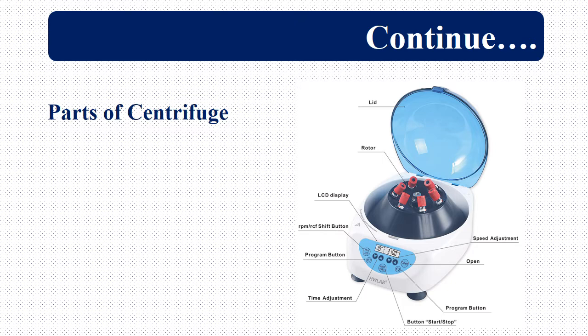Parts of Centrifuge: Centrifuge has lid and rotors which are continuously in the moving stage and then we have LCD display, on which you can set the speed, RPM, and timing of the rotation of the rotors of the centrifuge. On the LCD display, we have RPM Shift-button, we have programming button, we have time adjustment button, and we have the start stop button.